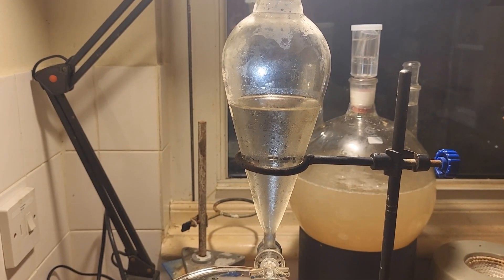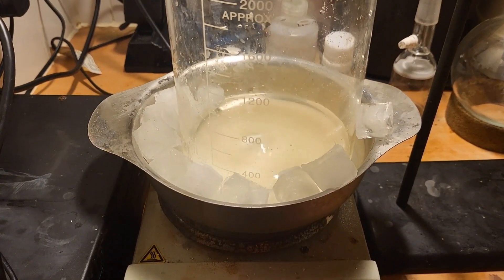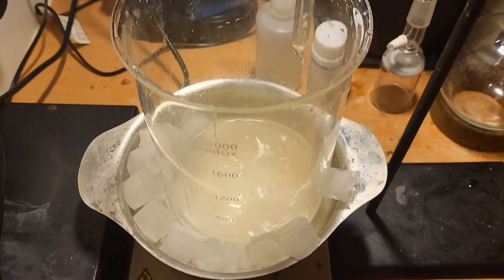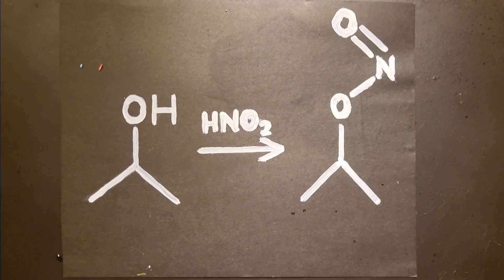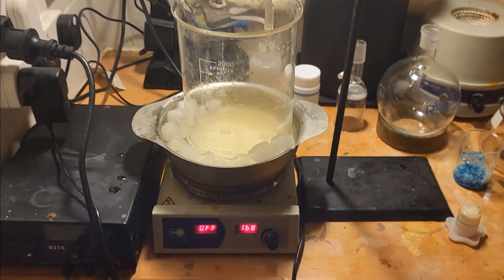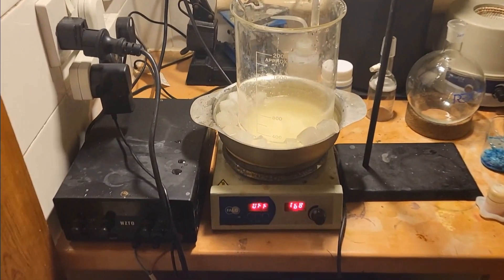Hydrochloric acid is in the separatory funnel that will drip down onto the sodium nitrite in isopropyl alcohol. I'm going to start by opening the stopcock — this is now dripping slowly. I'm going to add a small amount of water to this to stop it from heating up too much, but we do have an ice bath. I have the window open and an extractor fan running, and I've shut the door to the rest of the flat.